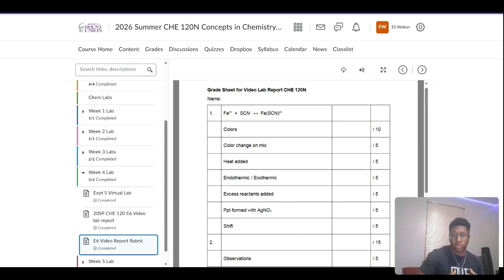As when you mix the solutions for FeSCN2+, removing SCN-, like with AgNO3, shifts the equilibrium to the left, decreasing the red color, making it more faded, because AgNO3 is more of a whitish color. Like I said before, the thiocyanate ions are a whitish color, so it's making it lighter and more faded away and more distant from the actual deep bloodish red color.